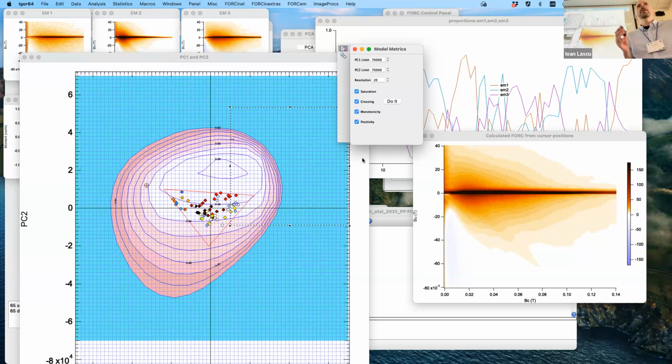We can try it, see if it crashes or not. But that is, yeah, absolutely valid. Especially if you don't have experience, why not use that kind of guide before you actually run the analysis.